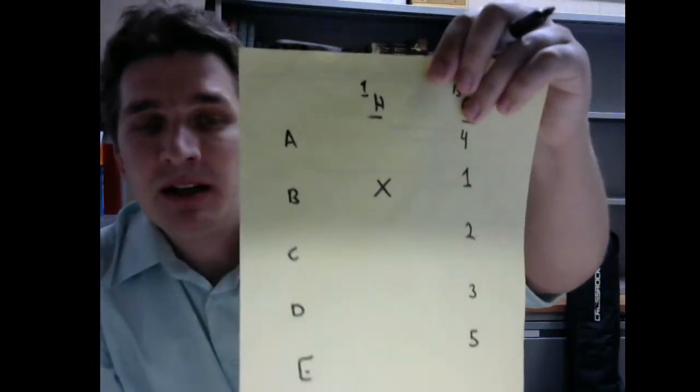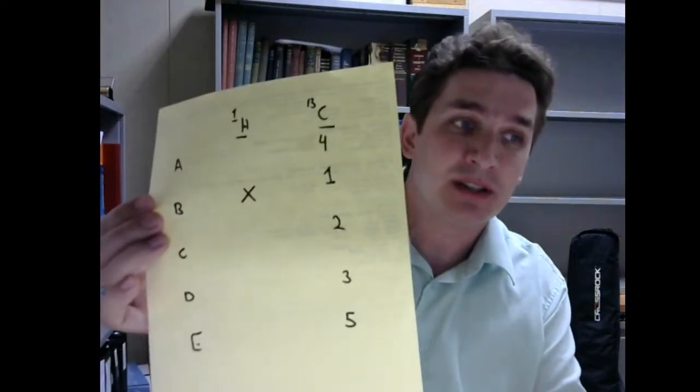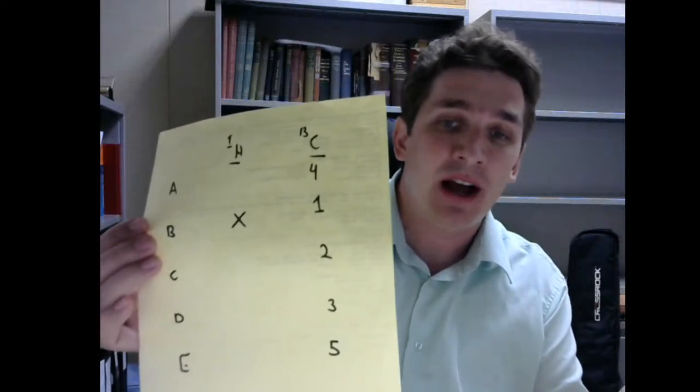So again, how did I arrive at this line of reasoning? Well, the more hydrogens we have around the carbon, the more shielded it's going to be because it's going to have a more negative charge around it. We're going to look at the oxidation states. So again, we figured out that carbon A was number 4 because it's got an area of 3, and there's only one where we got 3 types of the same carbon. E we figured out was peak 5 because E has the most shielding. It's got the most hydrogens around it, so that would be peak 5.